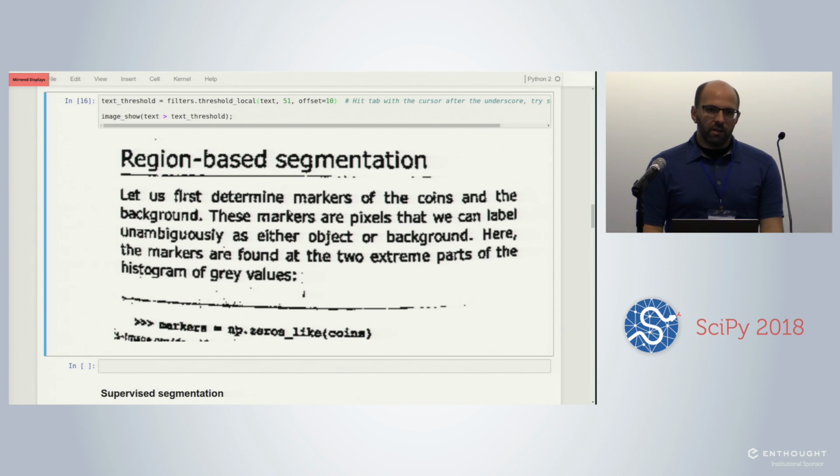I'm not getting into that here. In scikit-image.measure, there are a number of different metrics that I would try to apply to that problem. But generally speaking, what you would probably want to do first is get a ground truth, and then compare the difference between your result and the ground truth. It's a little hard to do that a priori. But you could do some fancy things and look at local entropy or local variation to see if you've still got too much noise floating around. That's how I would attack that. Does that make sense? Any other questions?